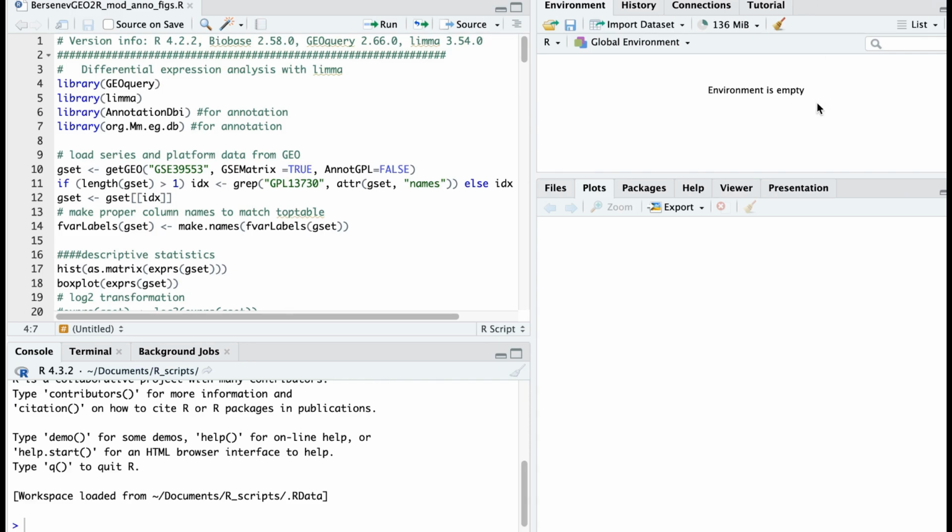But when you run the script yourself, then the business is completely different. The figures, when they're used in the right place, help you to make your choices. So it is a part of the diagnostics of the data and also a necessary part of the results, how you show them to others.